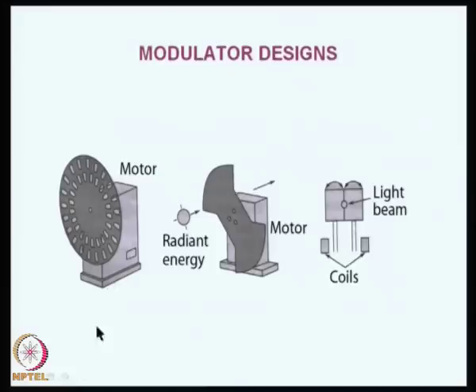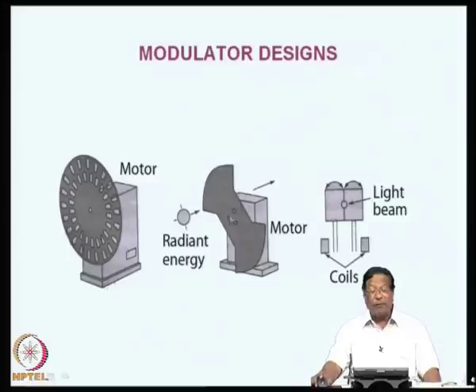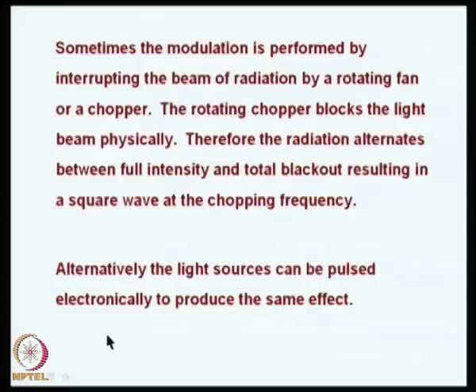What we do is, the beam of radiation is passing, and we just put a fan so that the beam can be cut physically. You can see the figure here. This is a fan, and you can see that there are a number of holes here, and when this fan rotates, the light will be passing alternately through this hole, and then it will be blocked again, then passed through the next hole. The middle figure is another design, or you can do it electronically with a light beam and coils, so it will just flip-flop this side, that side, etcetera. So, this is the type of modulation.